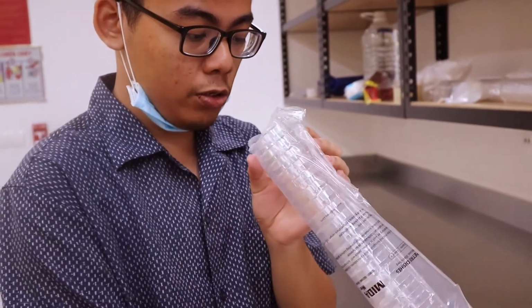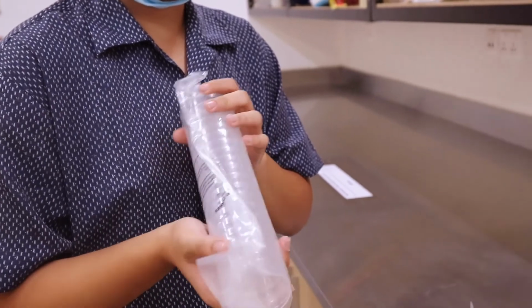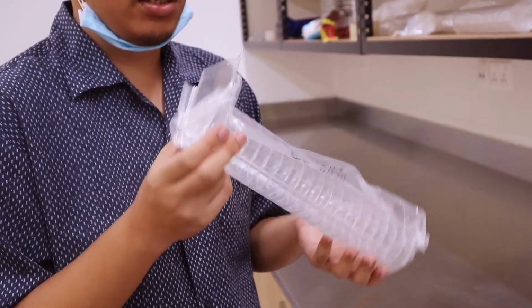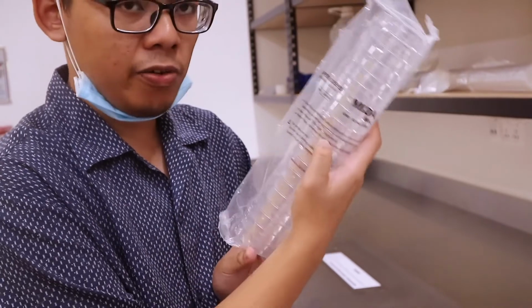In the meantime, let's unbox these petri dishes. We haven't introduced the specs of these yet. We use a 60 millimeter diameter kind of dish. 60 millimeters. And it's made of plastic, polystyrene. If you want to optimize the easiness of your project, so you can reuse dishes, you can use a variety of chemicals without having to worry about them being melted, you should use a glass petri dish, but we don't have enough budget, so we use a plastic one.